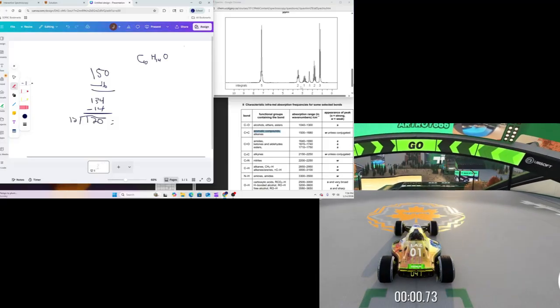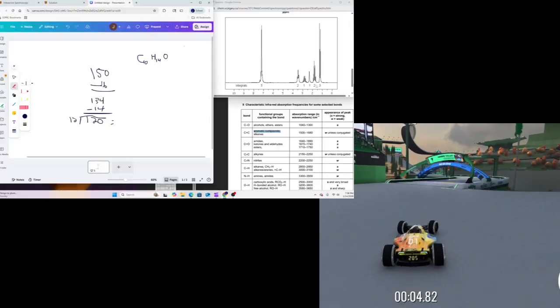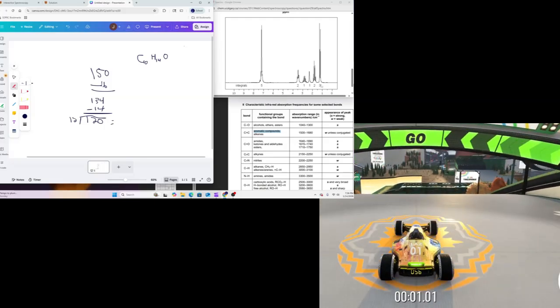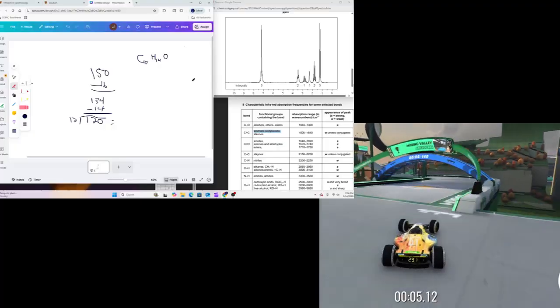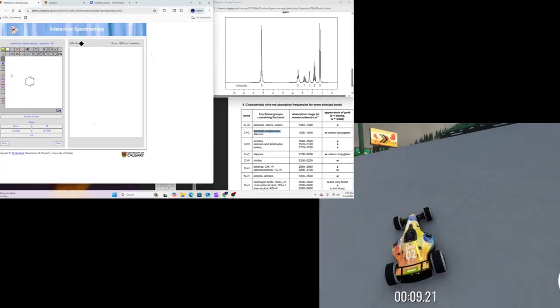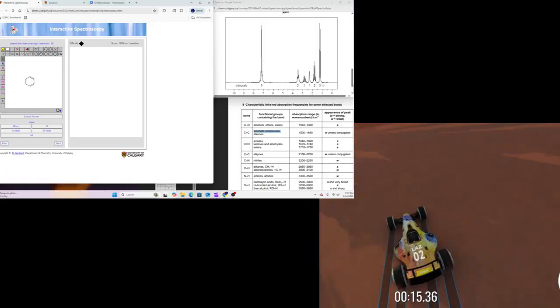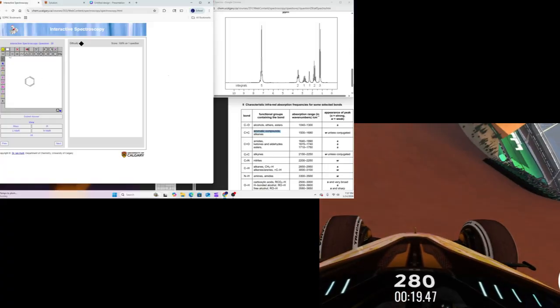And this is going to say that I have also a whole bunch of them that are at different spaces away from our molecule. Okay, so basically, what I'm going to see is this is going to be where at least 5 of them are. And I know that I'm going to have 1, 2, 3, 4, 5 different zones.